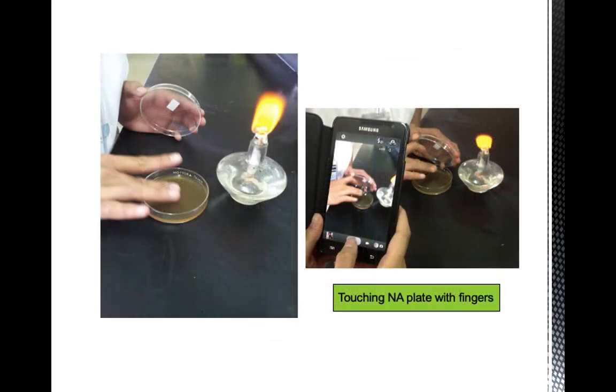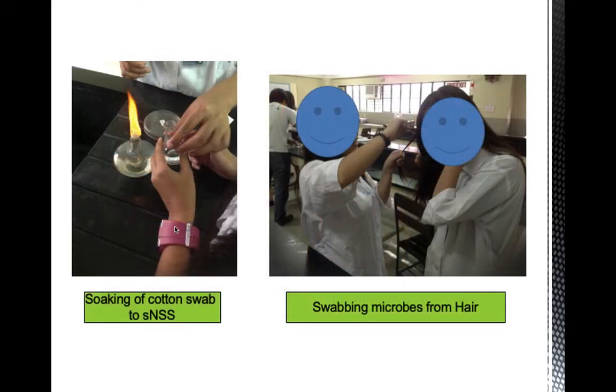Okay? Now, for microbes from the human body, it's a bit specific per part. For fingers, you just touch it. Technically, your unwashed hand, just touch the surface of your nutrient agar plate. For hair, swab with a cotton swab that is soaked in sterile normal saline solution.